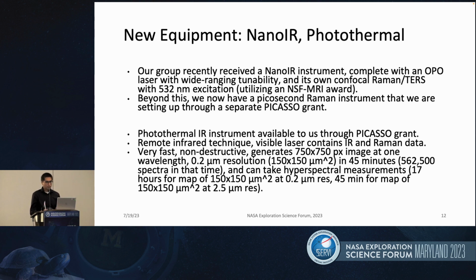And we aim to leverage this collected data and the results to hopefully enhance the accuracy of measurements conducted using Raman for spectrometers, enhanced hopefully by the nano-IR photothermal instruments, with a particular emphasis on the spatial distribution of simulants' compounds. This approach will not only refine future measurements, but also make data expectations more reliable for upcoming missions, therefore benefiting experiments performed by landers and rovers in the future.